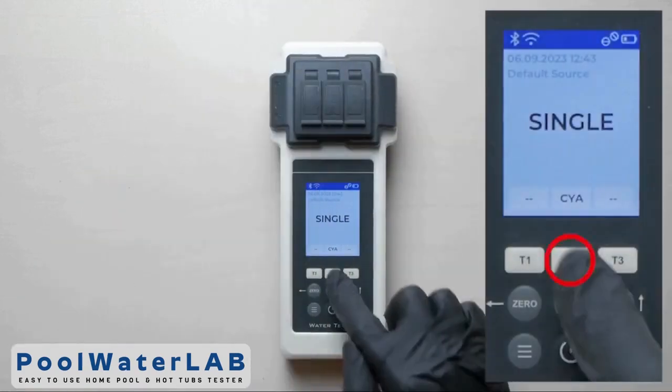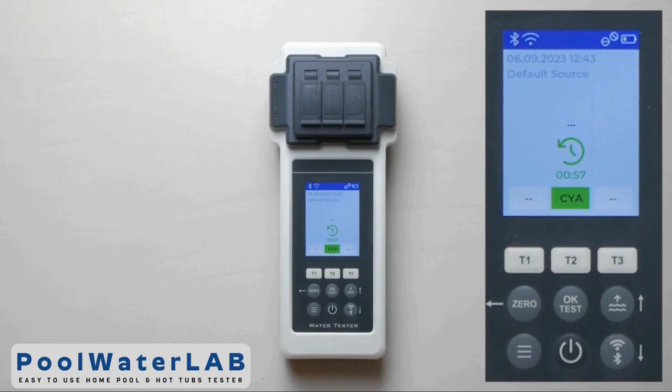Cover the measuring chamber. Press the T2 button, then press OK. Wait until the countdown ends and the test results appear.